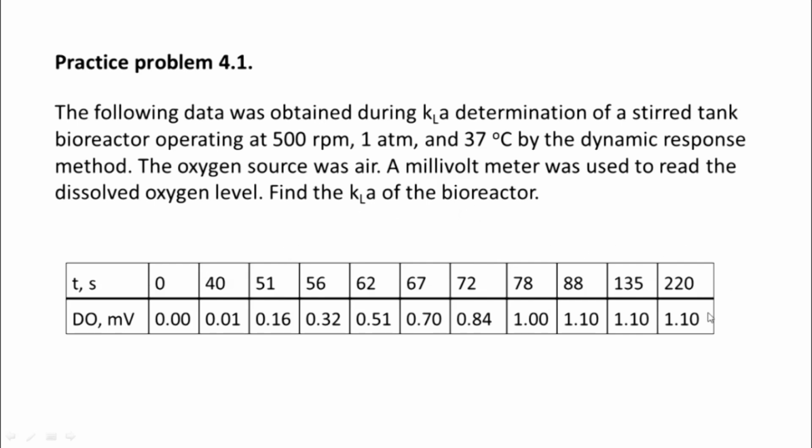This is the typical data that one gets. I think this is from my own experiment with the bioreactor during my doctoral days. Time versus DO, time in seconds, DO in millivolts. You have these various values. This is the data that is given. You're asked to find the KLA. Please go ahead and do this. We will meet in the next lecture and we will solve this problem.